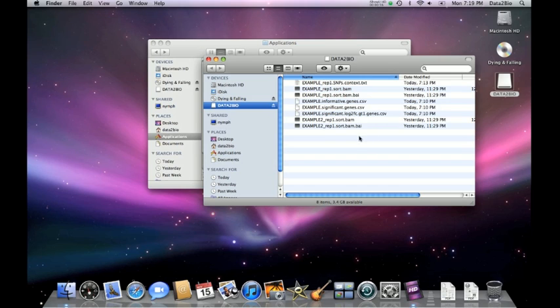For this example, the files we're interested in are this example BAM and BAM.bai, and you can see that there will be one of these sets of files for each lane of sequencing that you submitted for our analysis. In order to visualize the reads, which are stored within these files, we're going to use a program called the Integrative Genomics Viewer, which is produced by the Broad Institute.